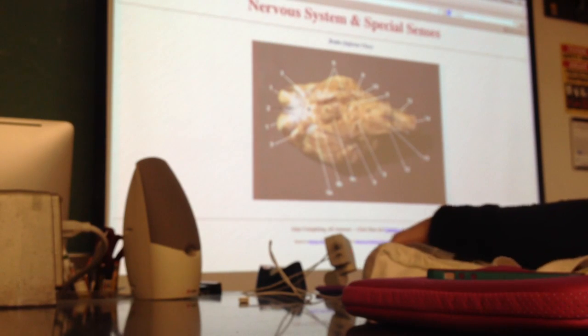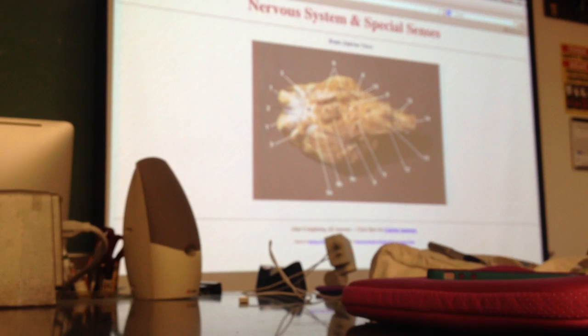So remember back to when we were talking about the brains and looking at the brain models, the cerebral peduncle was that striated area. So it looked like someone took a comb and combed it. You'll see that same structure here, except instead of actual indentations, you're going to see striations with these dark strings. So can you guys see those dark strands right there? Those are going to make up the borders of the striations that you see on the cerebral peduncle. So look for those on either side of the pituitary gland.